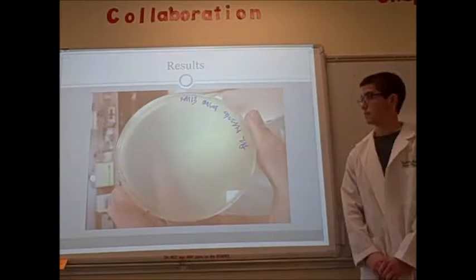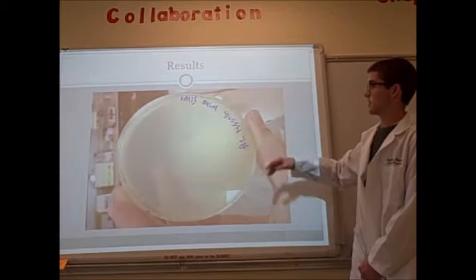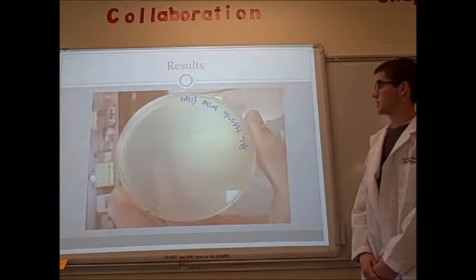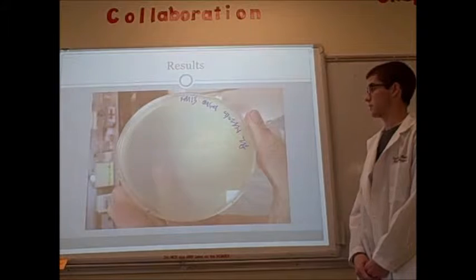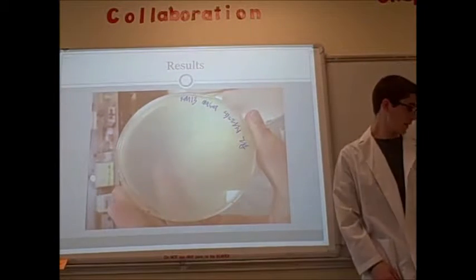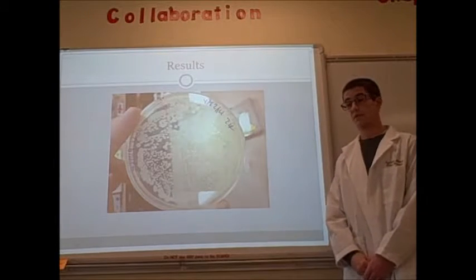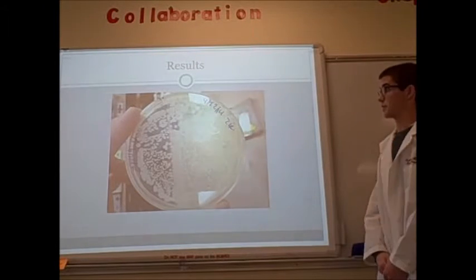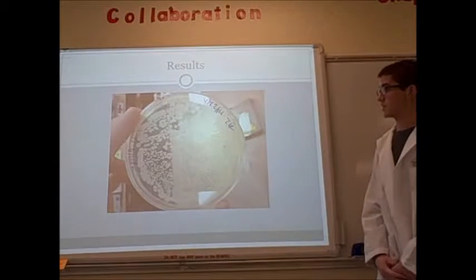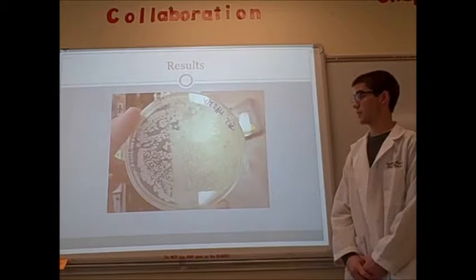So now for my results. The results of the experiment were somewhat inconclusive. Here you can see the positive M13 plate, which is the bacteria transformed with M13 DNA. This is the control plate. There was no growth. All of the plates were incubated for a full 24 hours and transformed at the same time to allow for control of the experiment.